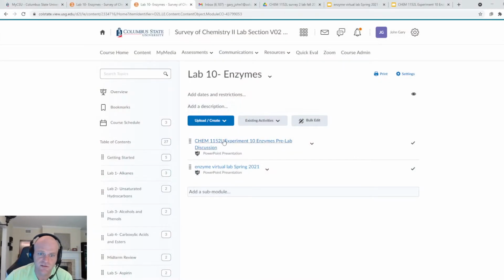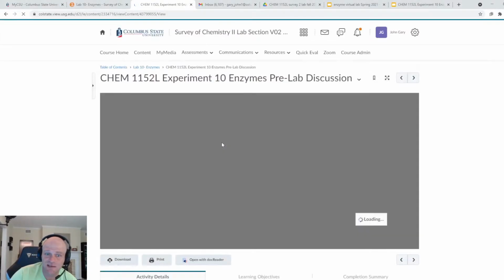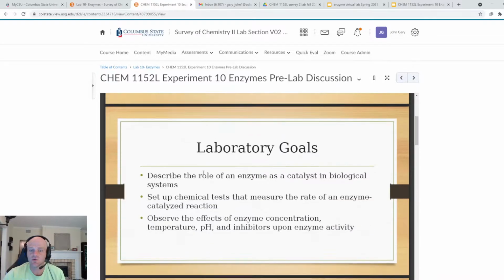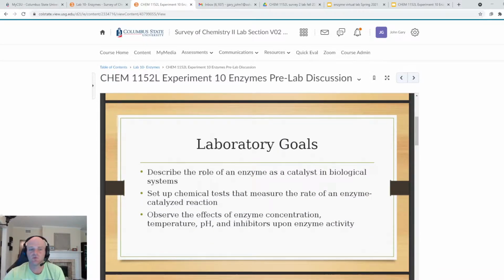First, let's look at the PowerPoints and do a little pre-lab discussion. Okay? So today's lab is enzymes, which you have seen a couple times already in this course, or in the last course and this course. Remember from the last course we talked about enzymes lowering the activation energy to speed up reactions, and we talked about different factors that could affect enzyme activity.